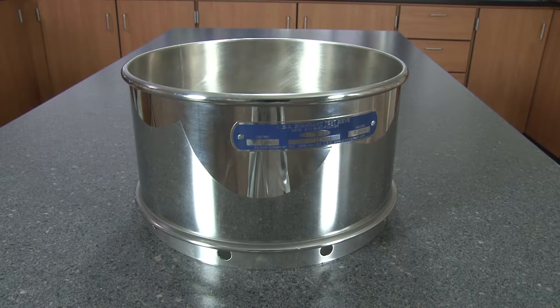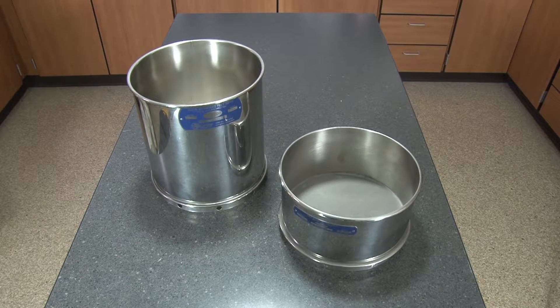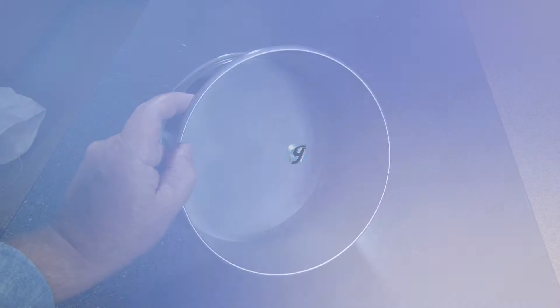The Gilson stainless steel deep frame wet wash sieves are ideal for the determination of fines content, or to wash away fines when preparing samples for particle size testing, making them the right choice for your material testing lab.